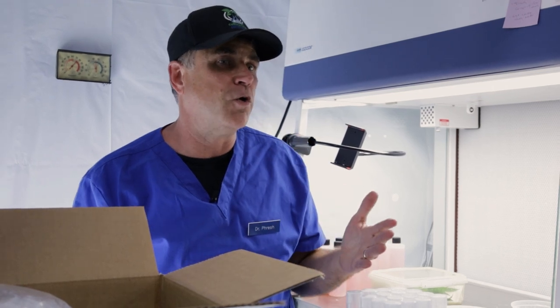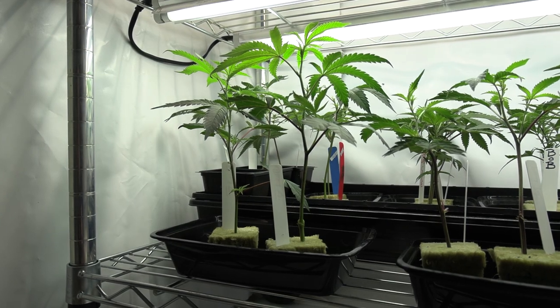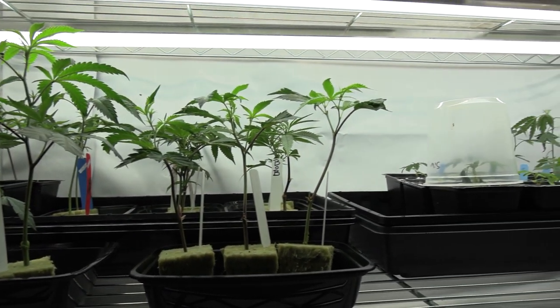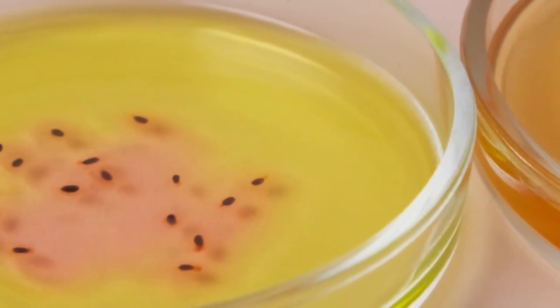Let's get started on what are the benefits of tissue culture — why do you even want to use it? There are two or three that are really important. The big one is that we can make new plants from smaller pieces, so it becomes a lot less necessary to raise a full-grown mother plant to take all the clones from. Mother plants are really the petri dishes for all the diseases we're trying to get rid of.